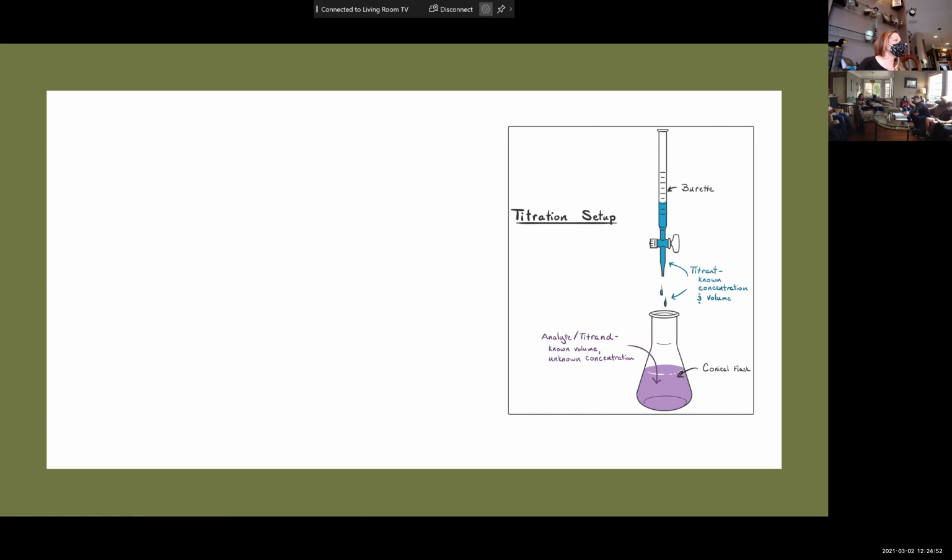It's because we use burettes. We used burettes last week and you saw how that very tall, very thin tube was super granular with the measurements, right? You could really see tiny, tiny portions of milliliters clearly on it. So when you use the burette for titration, you don't have to worry about counting anymore. And it is consistent. The drops are consistent. So it takes away the issue of squeezing too hard or too light.